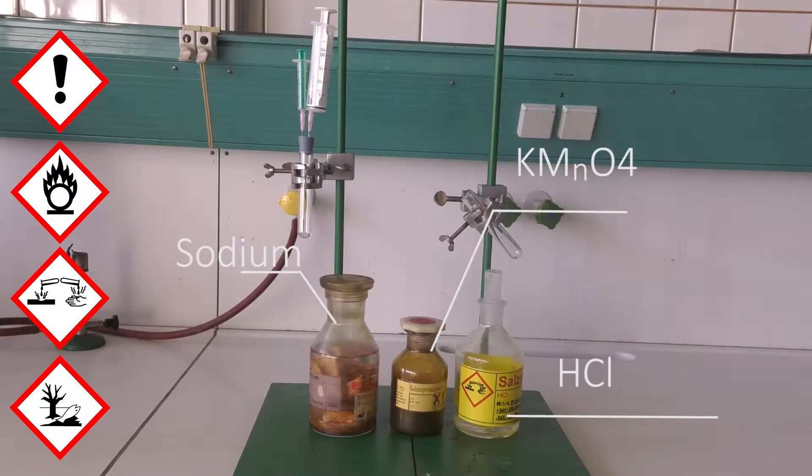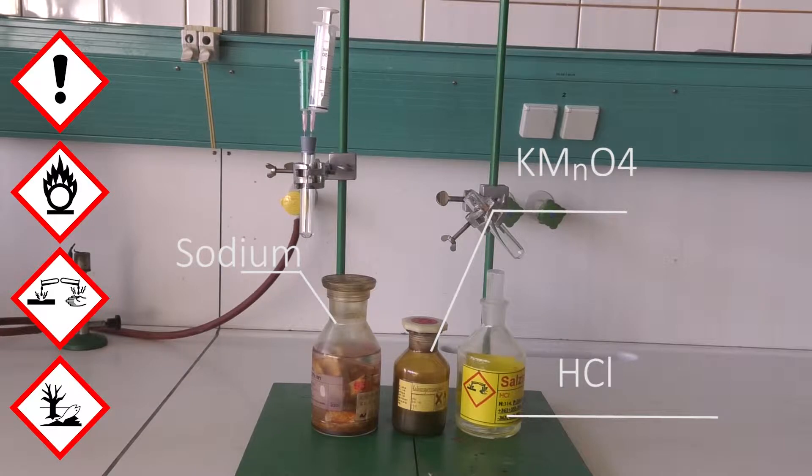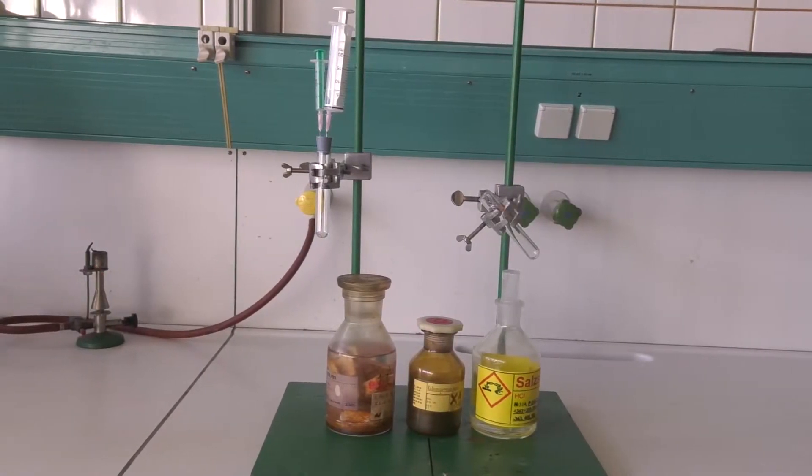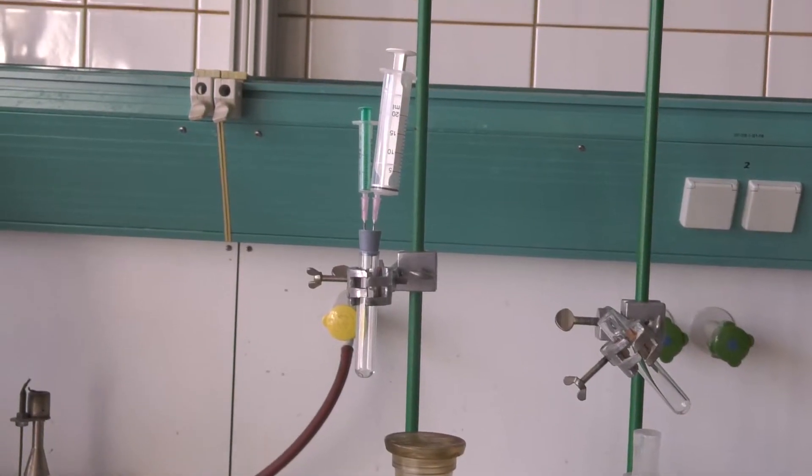For the sodium chloride synthesis we need sodium, potassium permanganate, concentrated hydrochloric acid and test tubes.